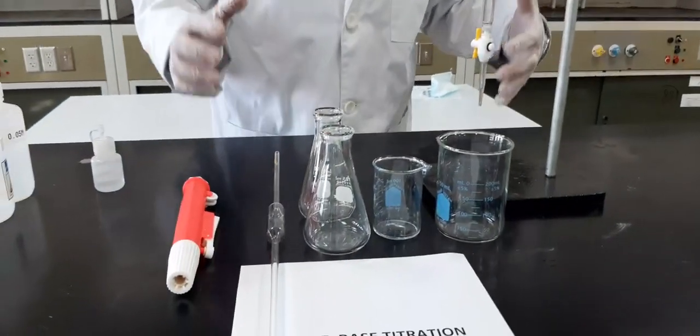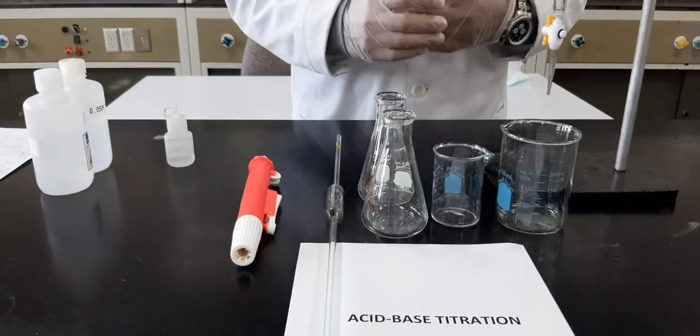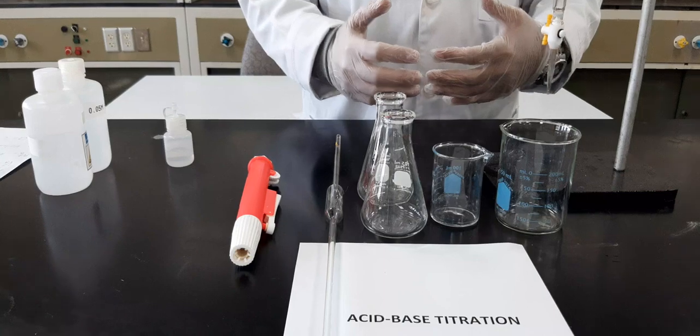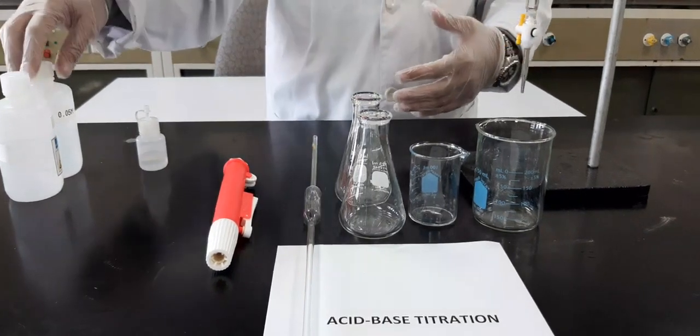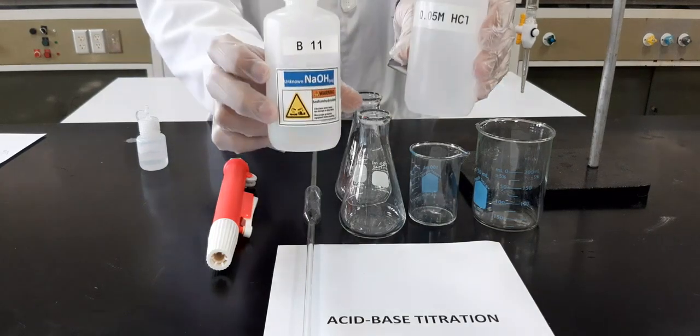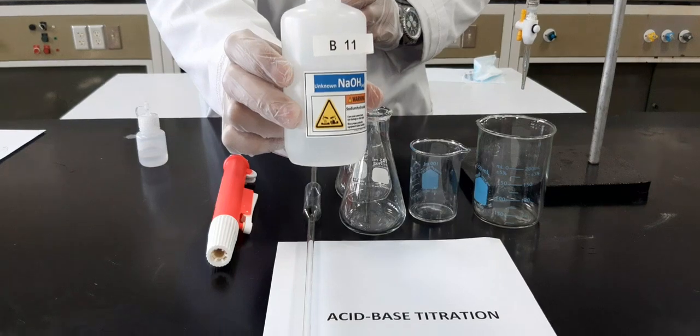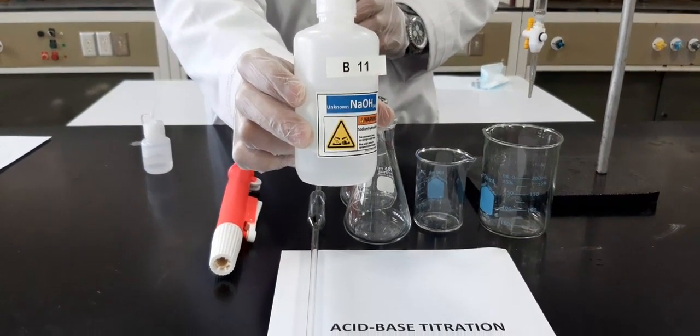What is the objective of this experiment? The objective of this experiment is to find the unknown concentration of a solution. So we will be given a solution. Suppose we have 2 solutions here. One is a base, which is B. In this solution, the concentration is unknown. We have to find the concentration of this solution.